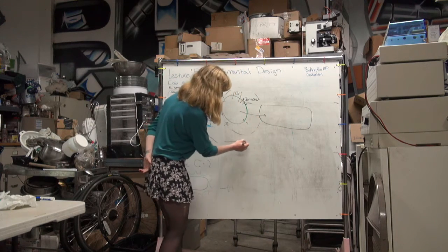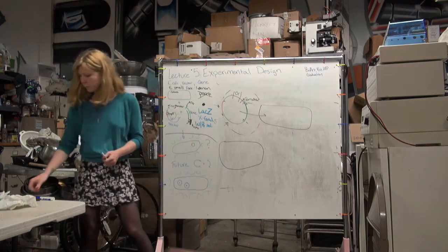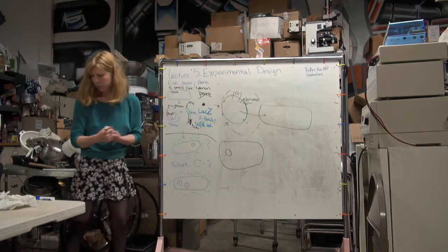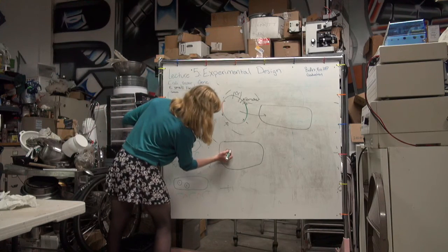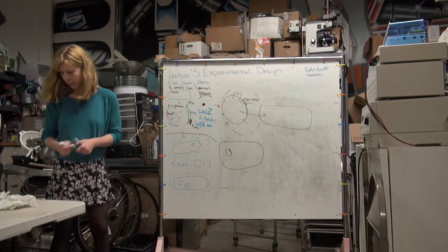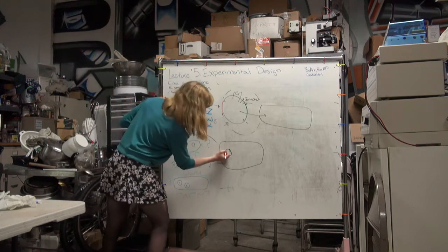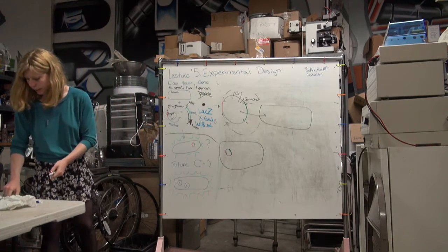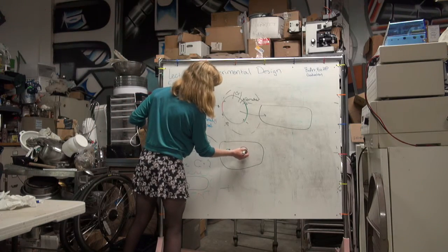So our transformation would have an E. coli that's been transformed. That's going to have one of our genes of interest. So we're going to start off with the one that works separately, and that's ampicillin resistance. And then we're going to get into our second gene.